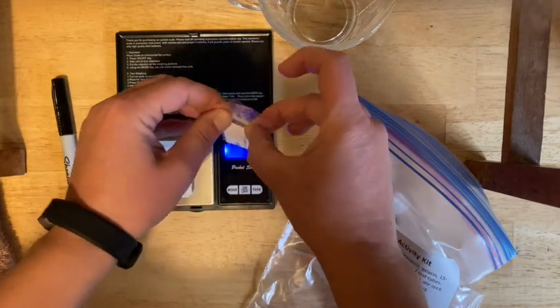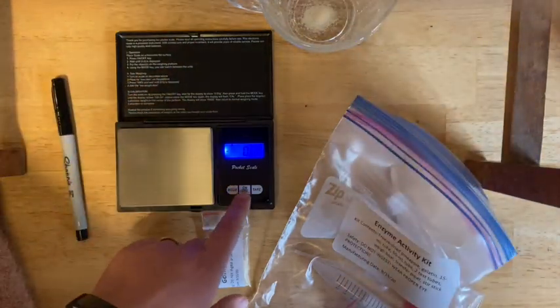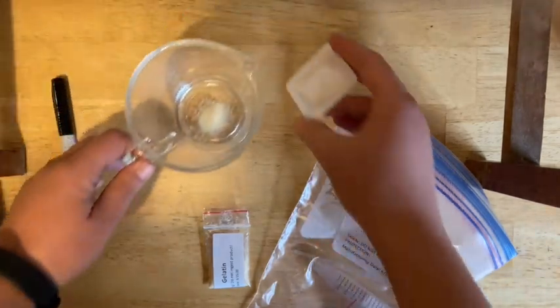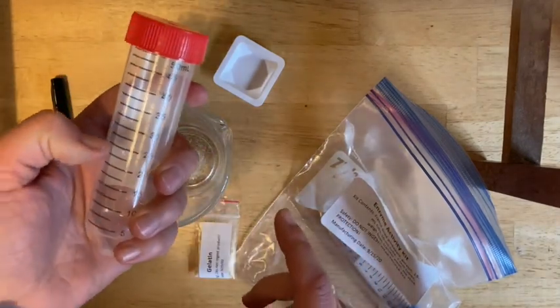Make sure you check your flowchart for what that amount should be. Take the gelatin and put it in your heatproof container. Then turn off the balance — you're done with it for now. Take your large tube and measure out the right amount of water.